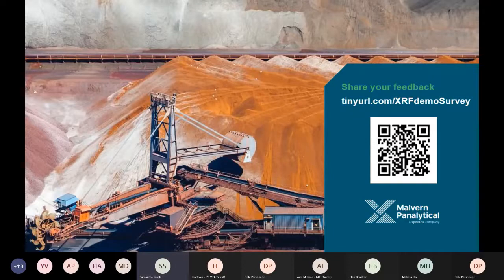That is a good question. So I suppose to a point the system's portable, as in you can move it from one laboratory to another laboratory. You want a stable location for it. But it is very easy to install.